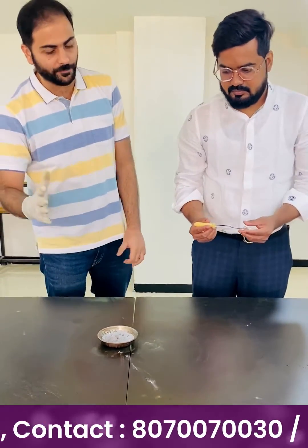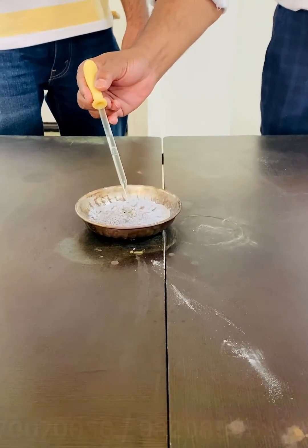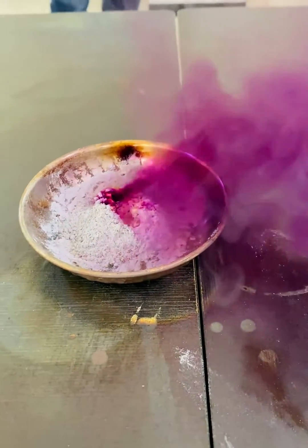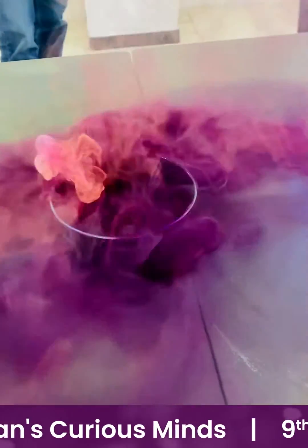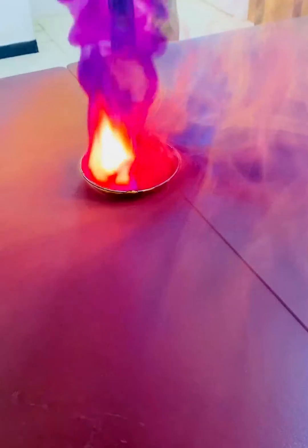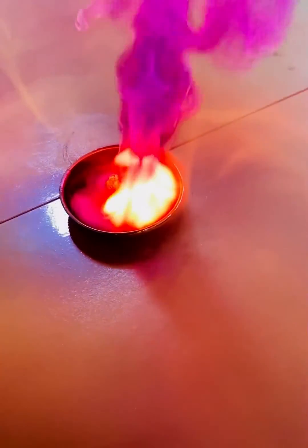Now it has started — you can see beautiful purple colored gas getting released. This gas is iodine gas. You should also remember the color of iodine from now on. Looks beautiful, right?